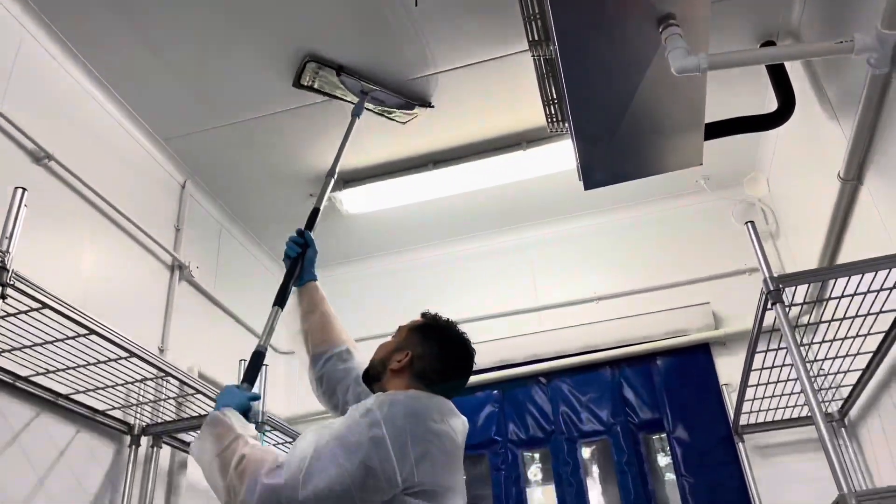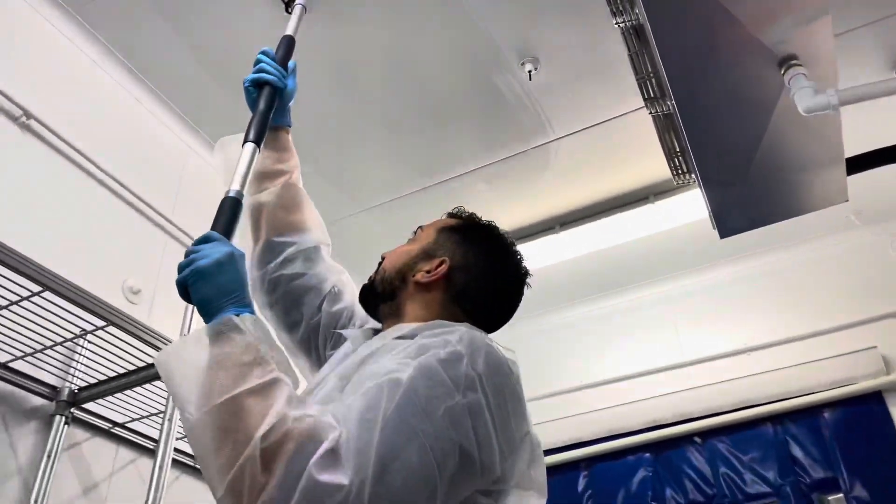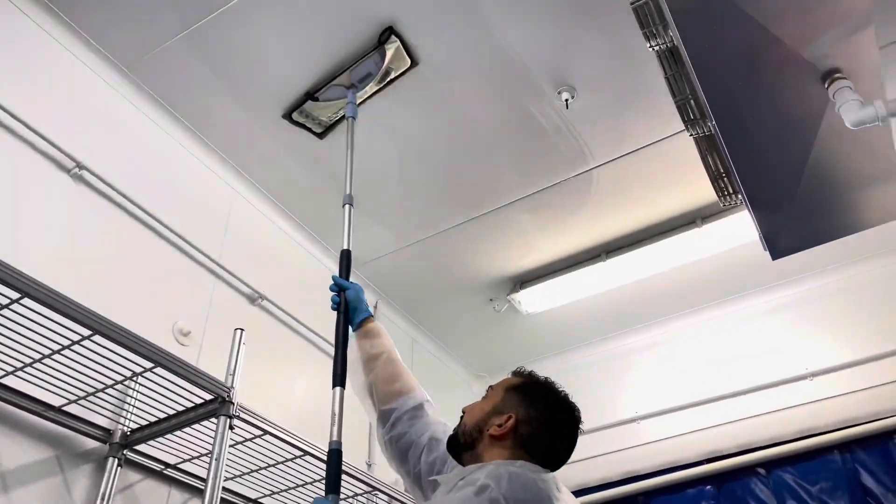You clean the ceiling in a similar manner, again using a different mop for the ceiling.